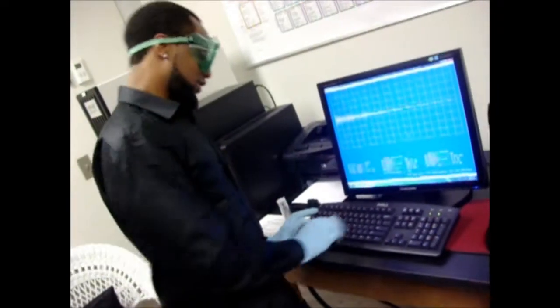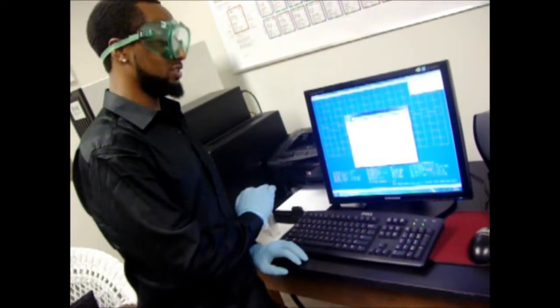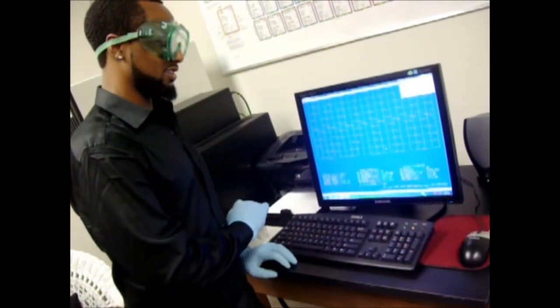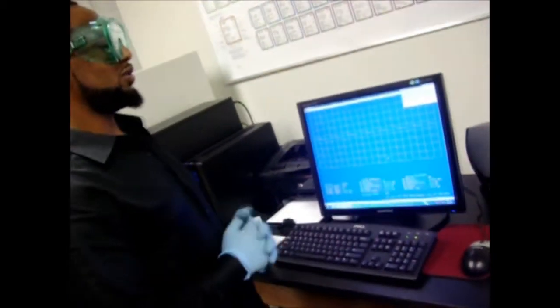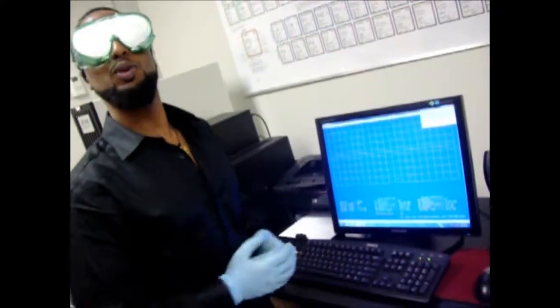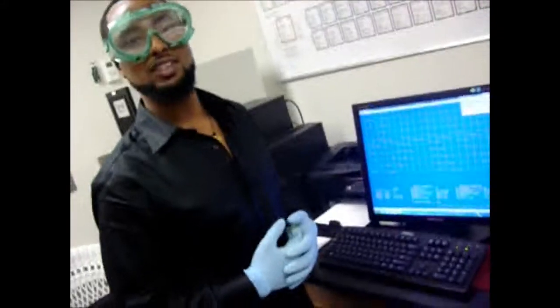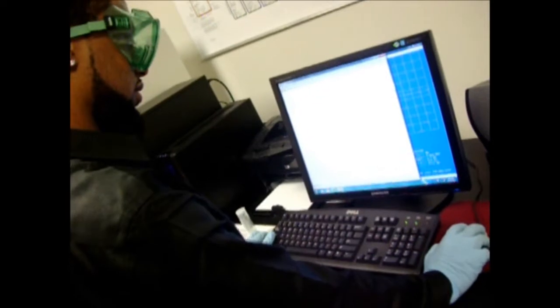The very next thing after the shimming process is completed is to press ZG, enter, enter. Then, while it's running the ZG, I will explain to you what we would do next after this process. Okay, so this is what our NMR is looking like right now. I got here using Alt-Tab after the ZG process.